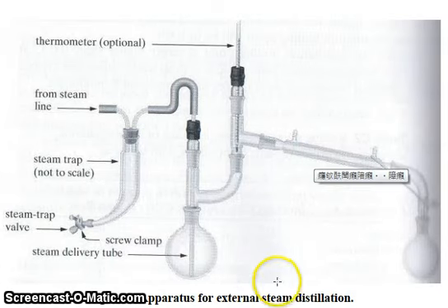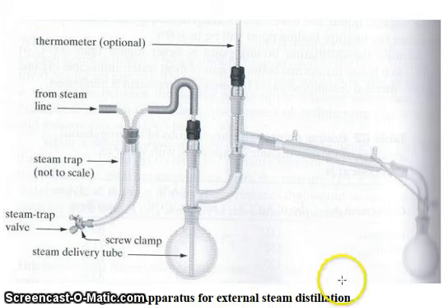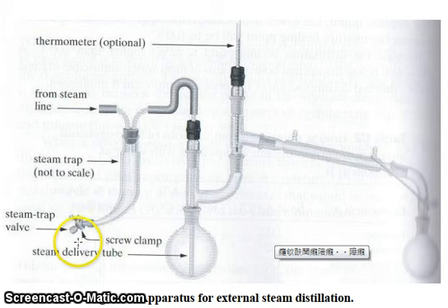And this is the apparatus for external steam distillation. You can see here, this is the steam delivery tube, this is the screw clamp, steam trap valve, steam trap not to scale, steam inlet and thermometer.